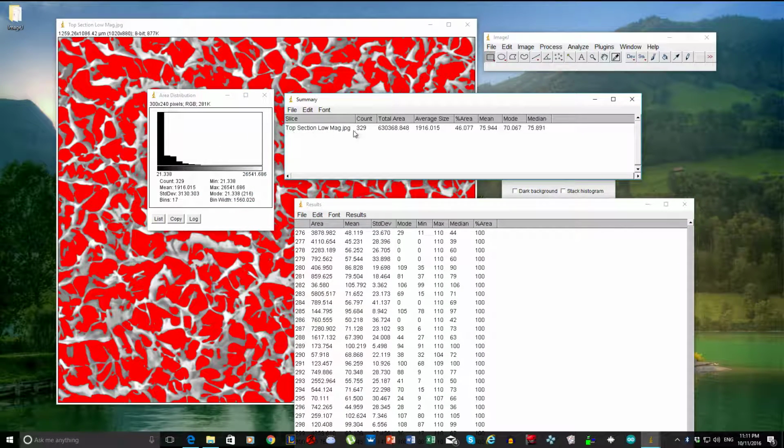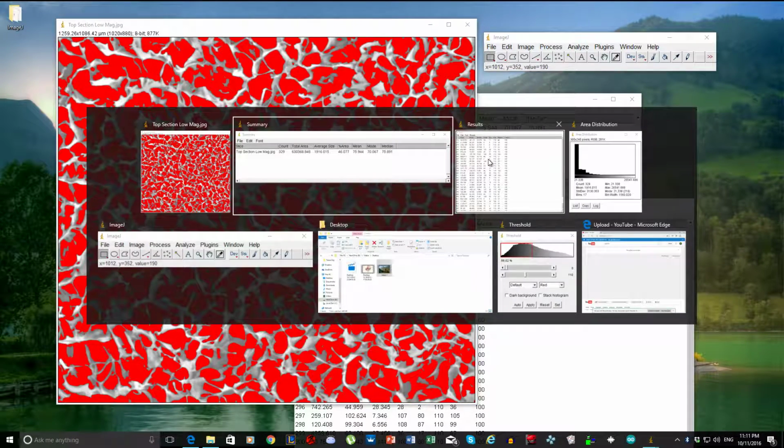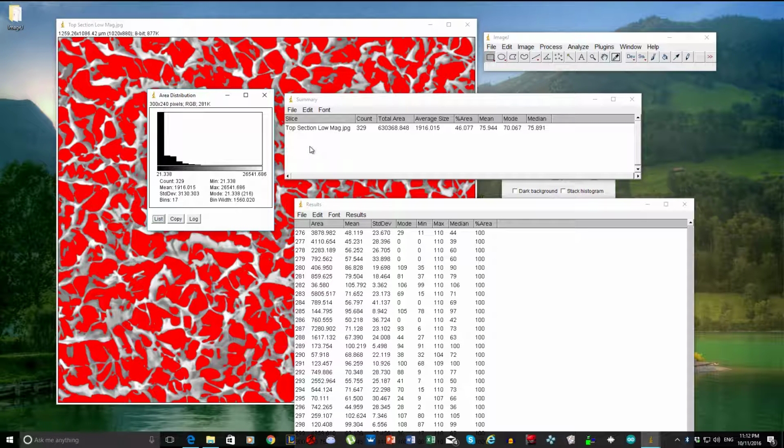And then the rest you can say, okay, you can show the picture here or the original one, and you can show the one I told you to save. Wait a second, where are you? Here it is. I told you to save that, the pore count, and yeah, that's how you would do it.